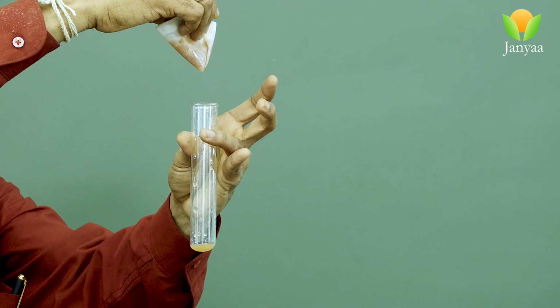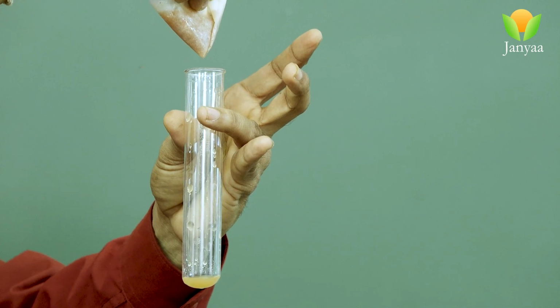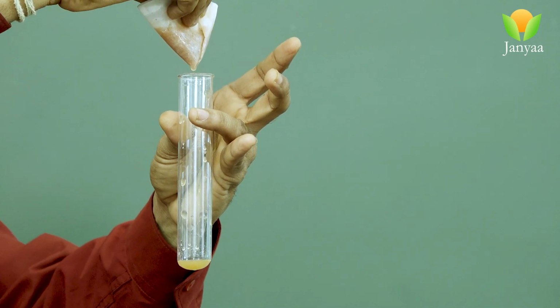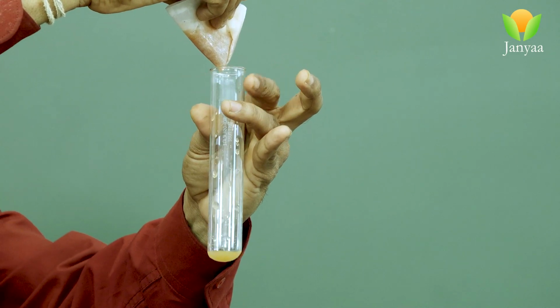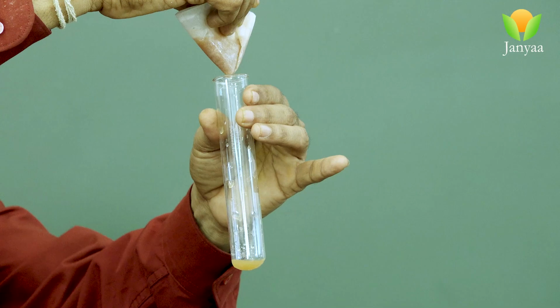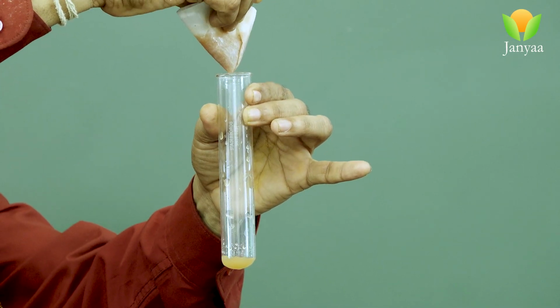Drop by drop the water is filtering, and we are separating the water from the soil. The nature of the soil we can test by using the pH paper, you see.